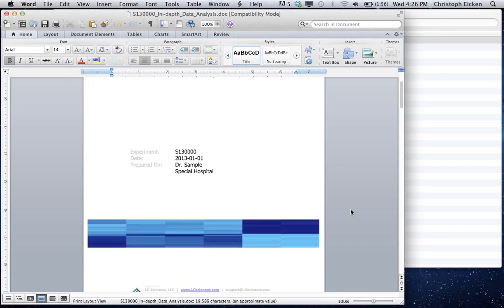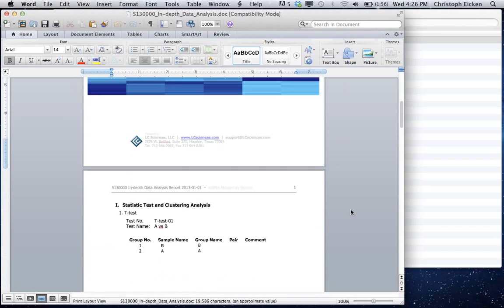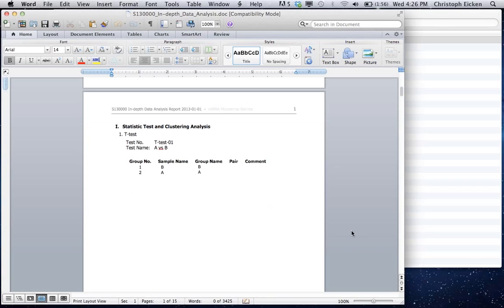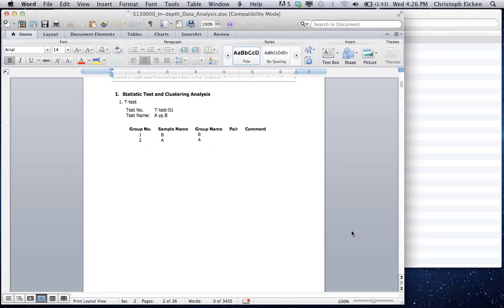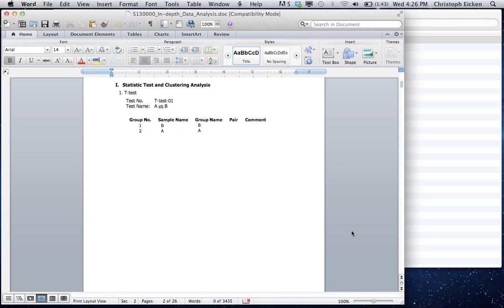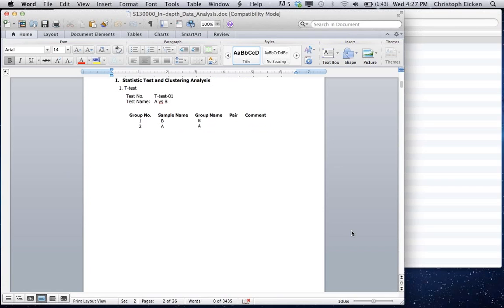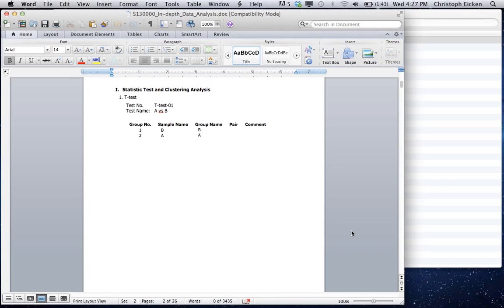Again, you see which statistical test was performed and how the samples were grouped. But, of course, with one sample each per group, in this case A and B, you cannot do any statistics. So the only way we can provide you with any data in this case is if we use the probe repeats that we have for each microRNA on the chip.